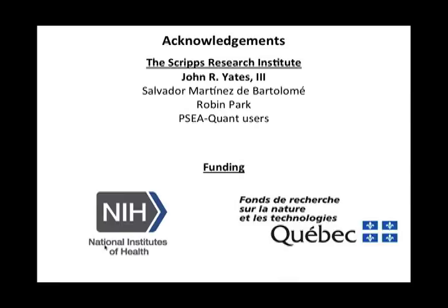We think this can help users get around the tool and provide more technical details that were not provided in the original publication of PSEA-Quant. And we hope that this will be published fairly shortly.